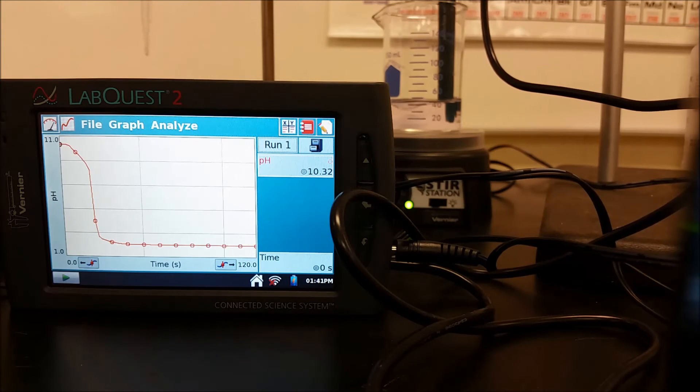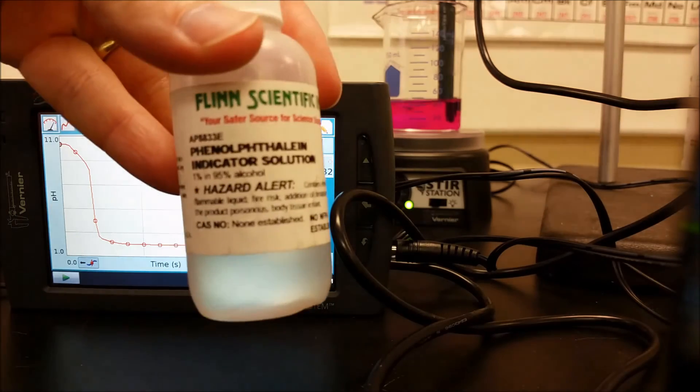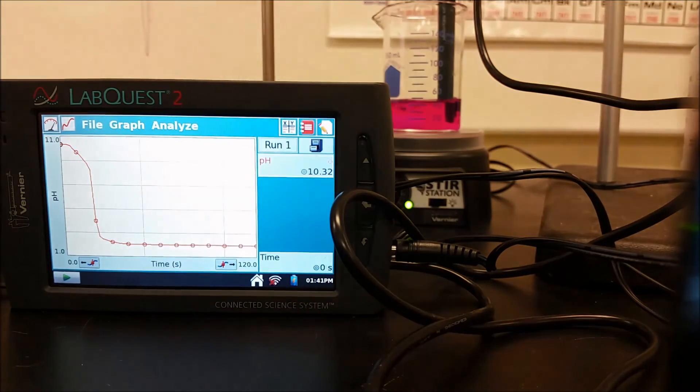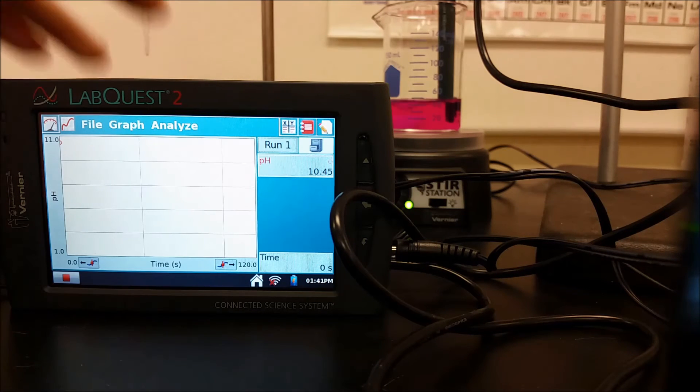In this next example, we're going to run the opposite titration. Now we're doing a weak base with a strong acid being added to it. So now I'm using the phenolphthalein again, but this time when I run the titration, we're going to see that the phenolphthalein is not a good choice for this particular titration.